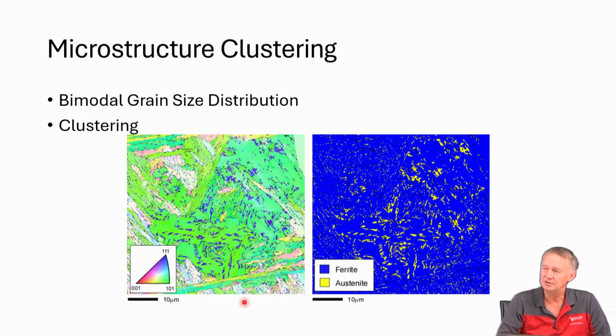maybe something like that would interfere, right? Recently we were doing some work on ferrite and martensite, but we can't distinguish them, because both are BCC, or BCT, or maybe martensite is also BCC. Okay. So that we could not.